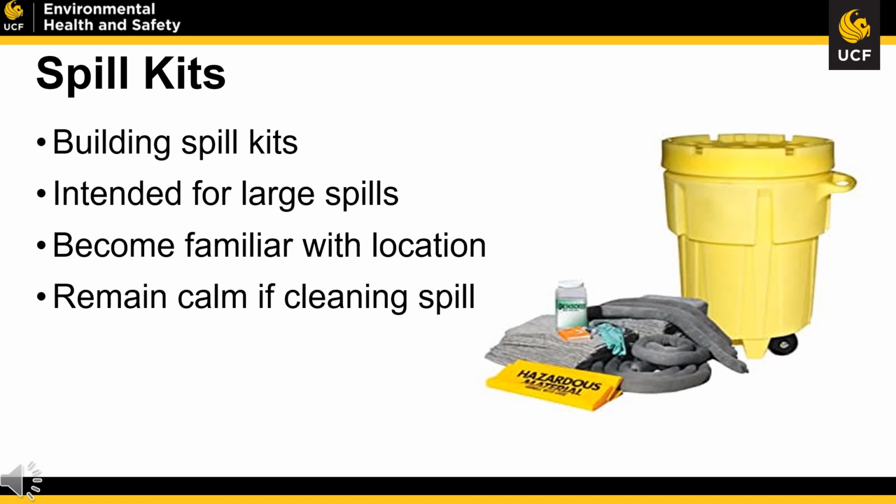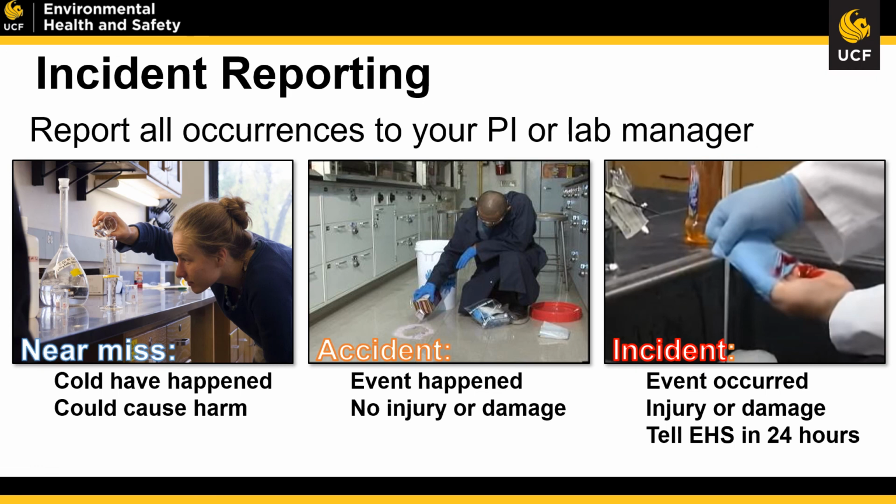These spill kits do have tags placed on them to ensure that the contents are still within the kit, so don't open the kit unless you need to use the kit. Incident reporting. At UCF, we have three different types of incidents. We have what's known as a near miss, an accident, and an incident.